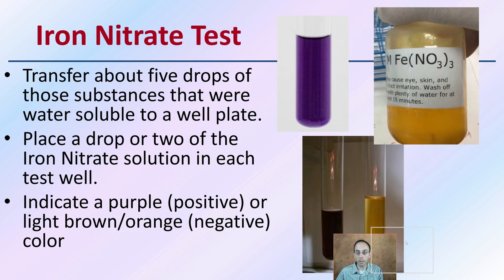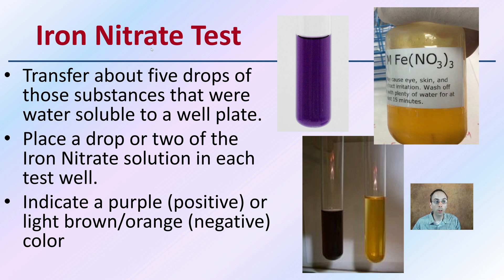For the iron nitrate test, transfer about five drops of the substances from the water-soluble well plate test and place a drop or two of iron nitrate solution in each test well. A purple coloration is a positive result, while a light brown-orange is negative. Note that if the sample is well lit, you'll see a deep purple color, but it could look almost black depending on the lighting.